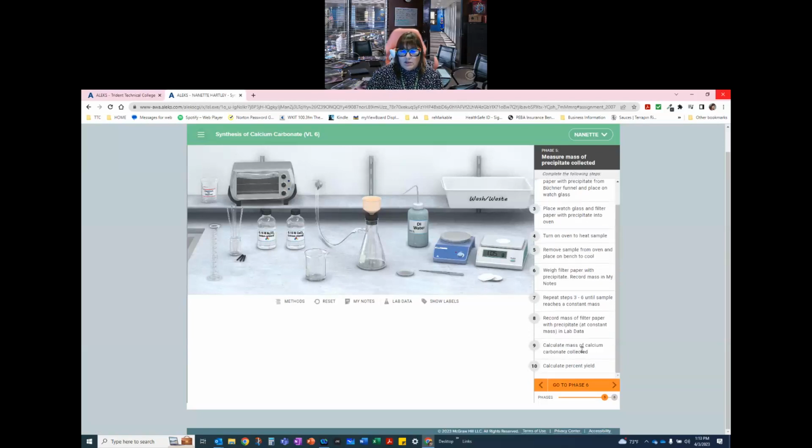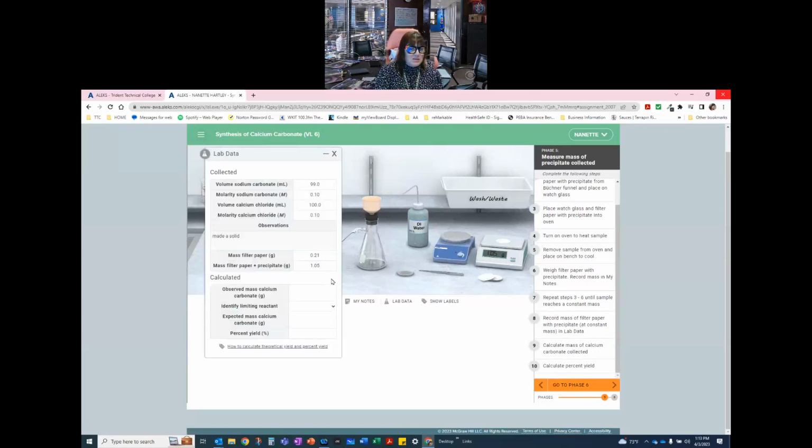In lab data, calculate the mass of calcium carbonate that was collected. Okay, so how would I do that? That's a mass by difference. So I take that mass that I ended with, and I subtract the one that I started with, and that's the number that I need to record.